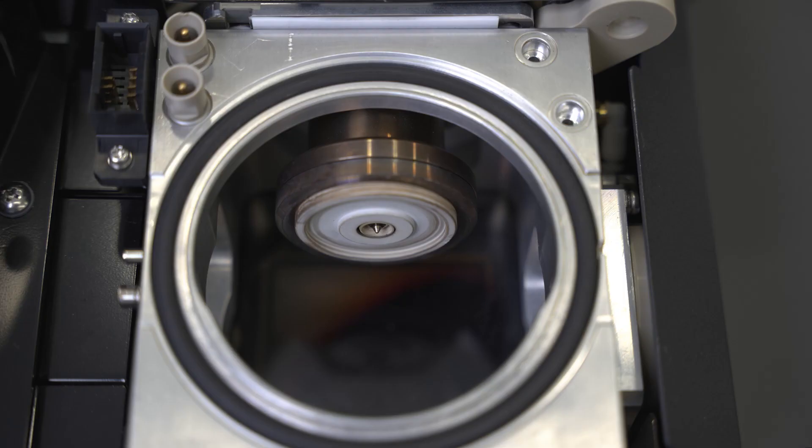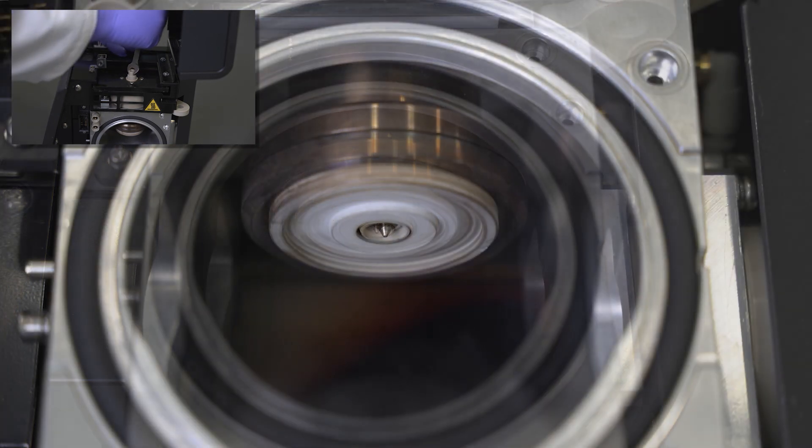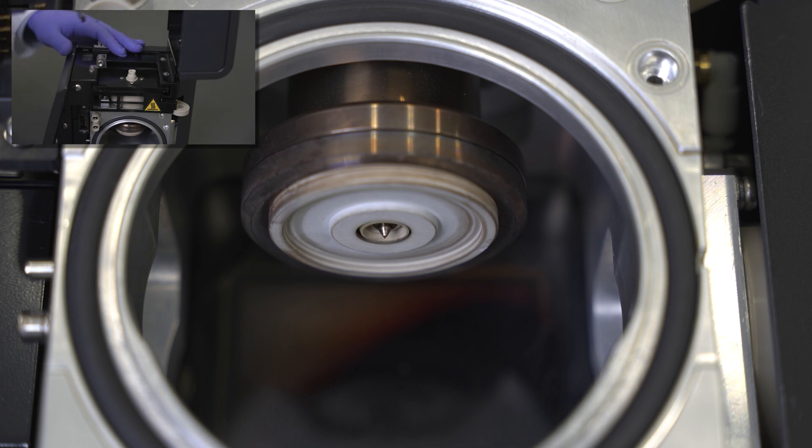Adjust the ESI spray needle protrusion to 0.5 to 1 millimeter by making the needle flush with the tip and turning the assembly clockwise. Each 180 degree turn extends the needle by 0.5 millimeters. Add the locking nut to secure the capillary in place.